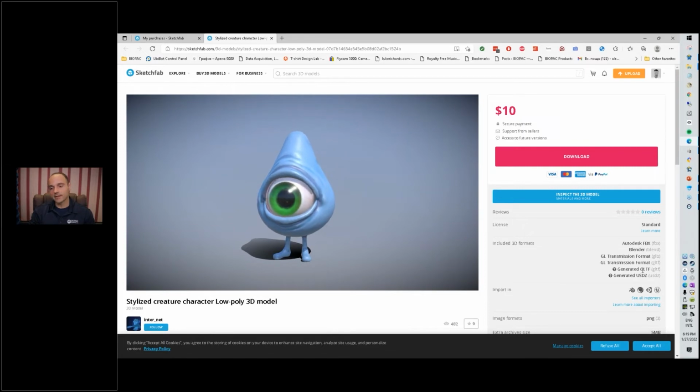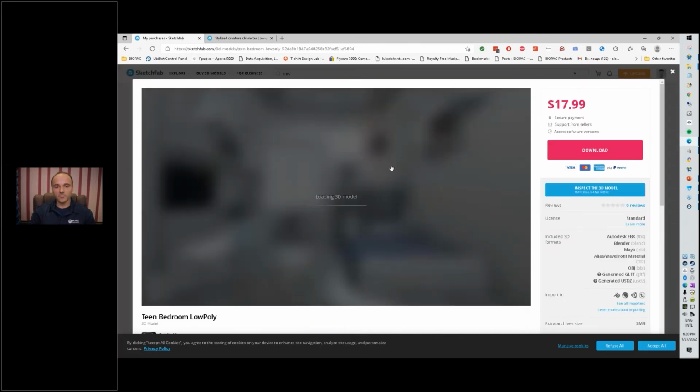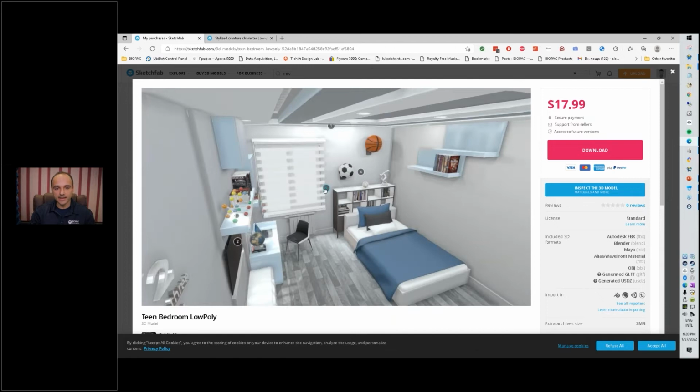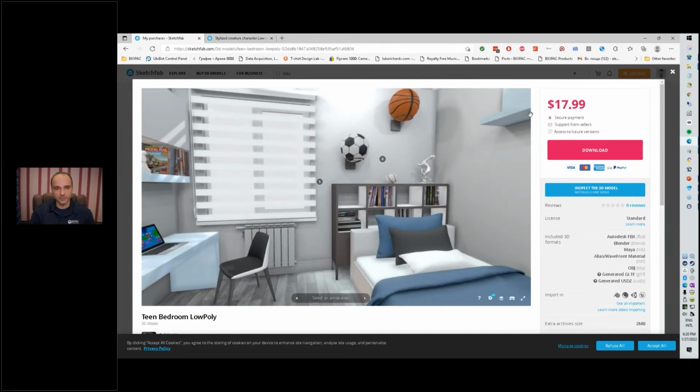That's the format you want to make it work with Vizard. So you need the GLTF format. In fact, all of these things come without any additional work. Just get them from the web. Like the room here, that's also just a 3D model. I did not actually create any 3D models. I just got the 3D models.